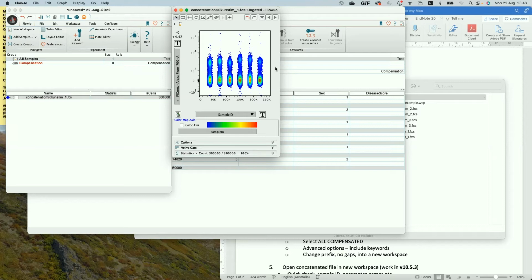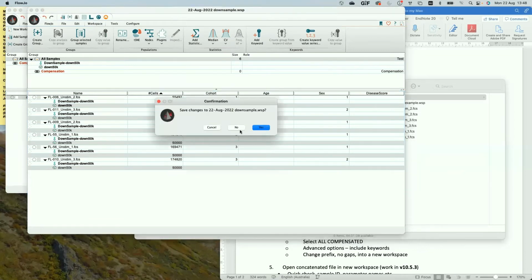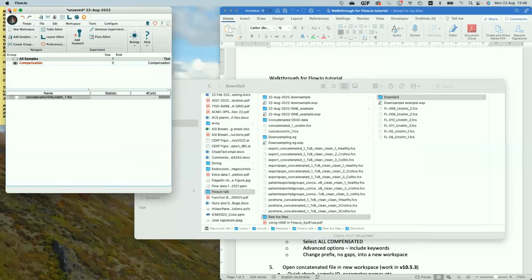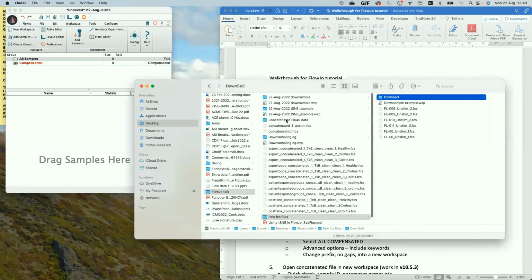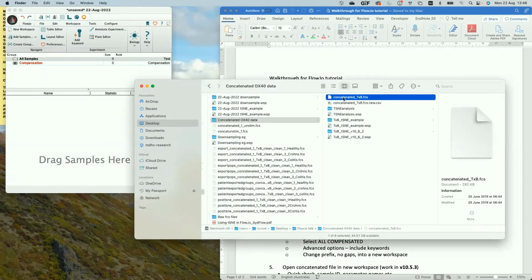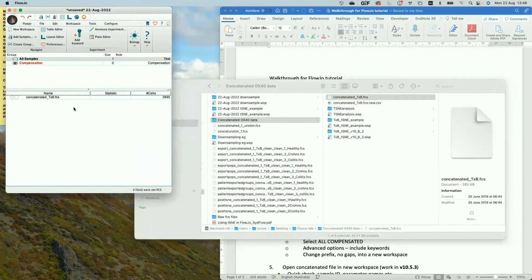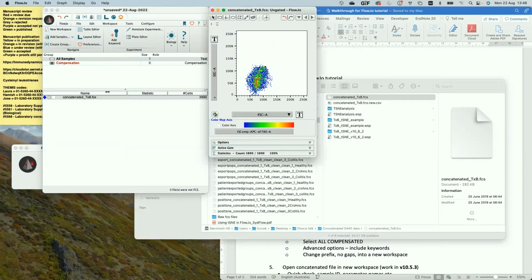So I now have my concatenated file that I want to play around in. So I will get rid of these examples, and I will now load up a concatenated file that I've prepared earlier, like a good cooking show. And we'll have a little bit of a play around with tSNE. Okay, so here's a concatenated file that I've played around with earlier.